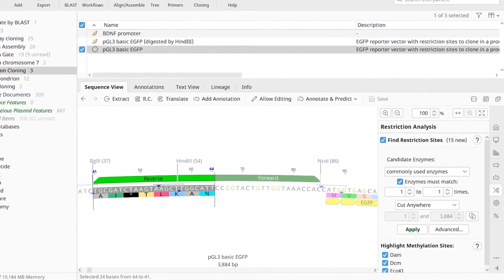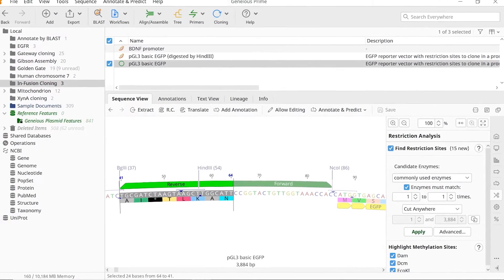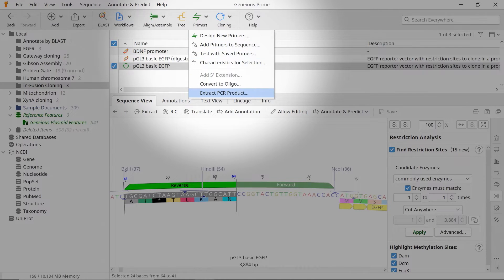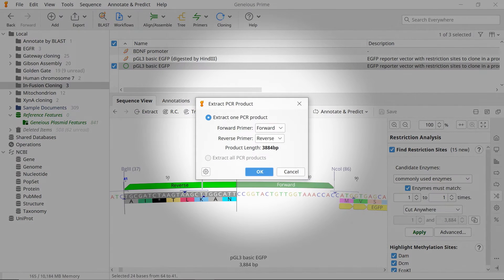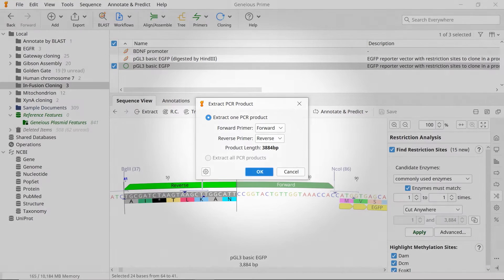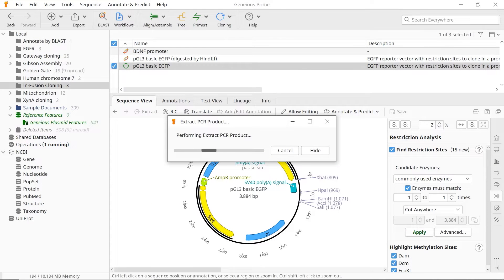To simulate the PCR to linearise the vector, go to Primers and select Extract PCR Product. In the new window, use the drop-down menus to select the primers you just designed and click OK. The result is a linearised vector.